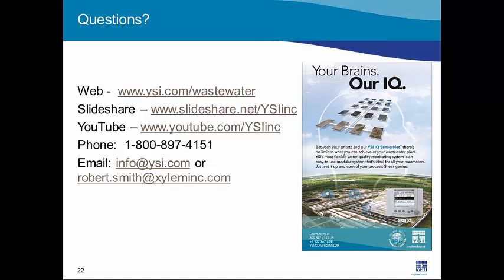Okay, the next question is, do any regulators accept YSI sensor results for compliance? Well, if you're talking about pH, yes.